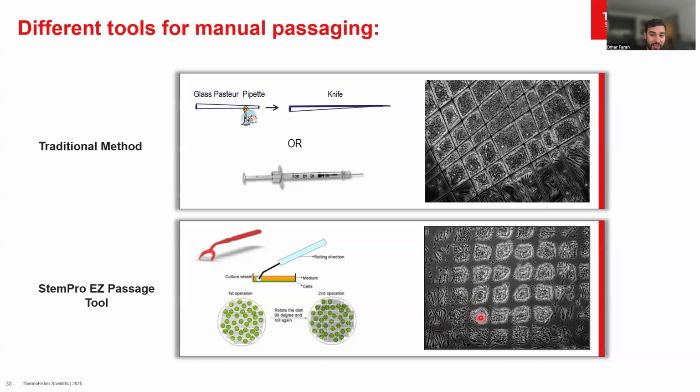This does a really, really good job of maintaining a nice size for these squares or sheets, but it is slightly at a disadvantage when you don't have as much control over which cell types you are rolling over or not, because you're not seeing them as easily. So this is one other kind of downfall.